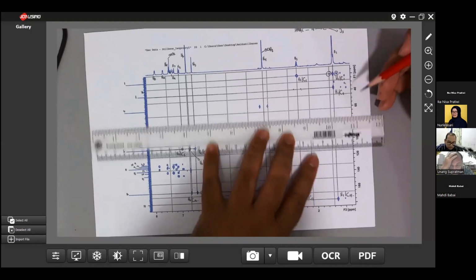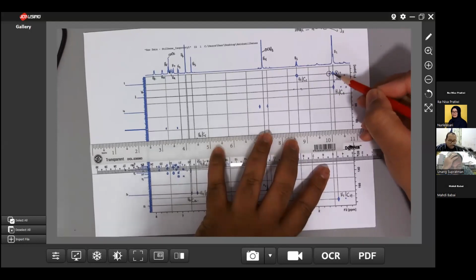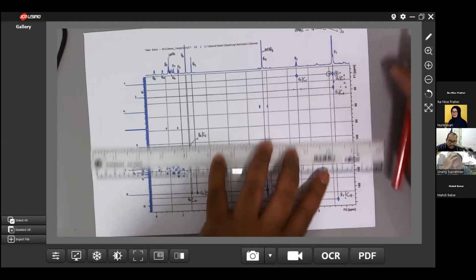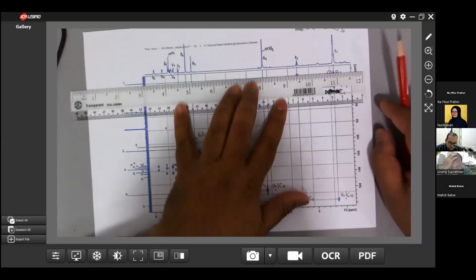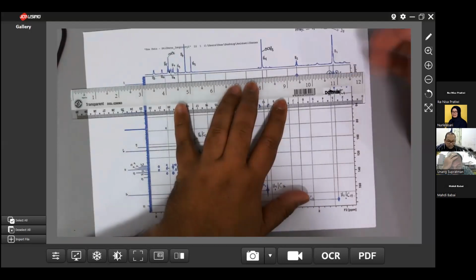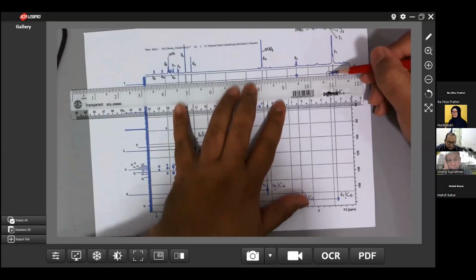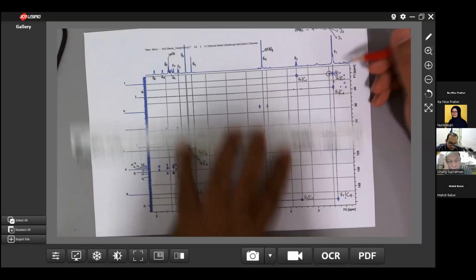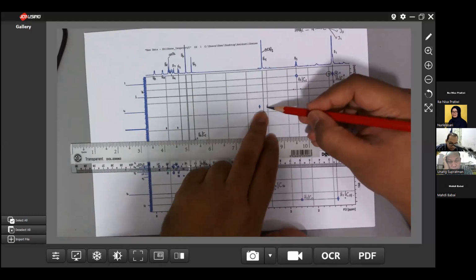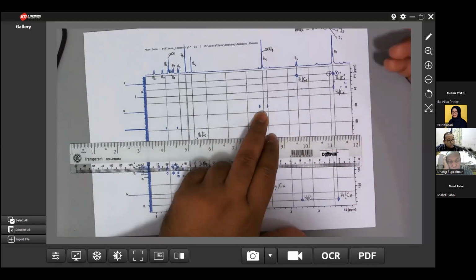If you see this kind of two dots here and the straight line, usually you can see the correlation in J1. It means it's in the middle here, similar like this. Proton number 4 can see carbon number 4, but sometimes it happens, sometimes it's not.